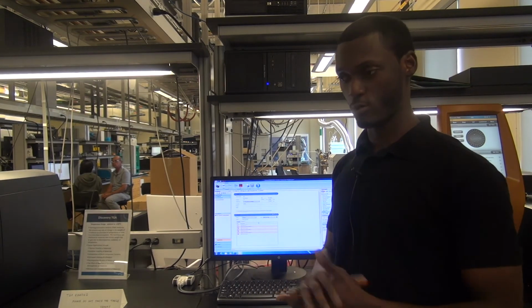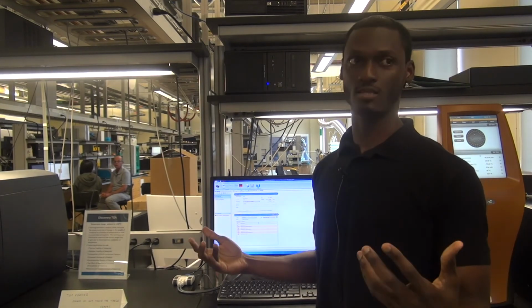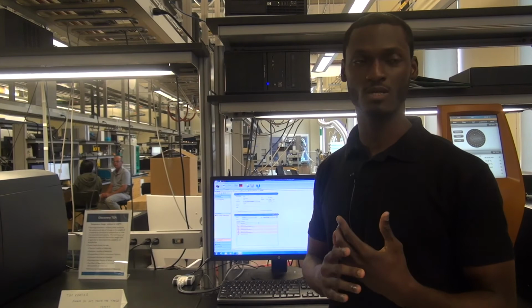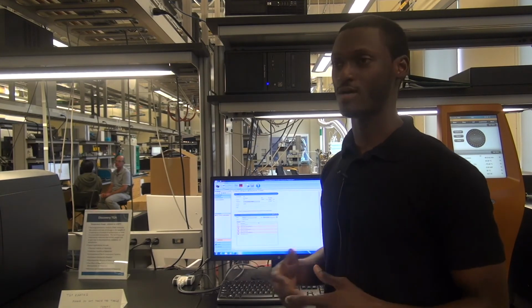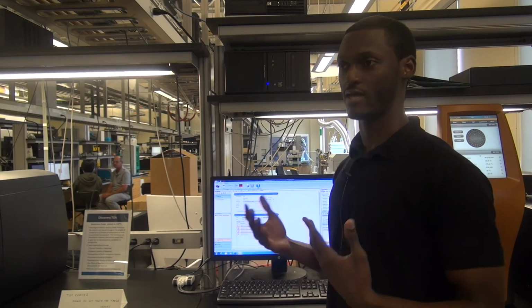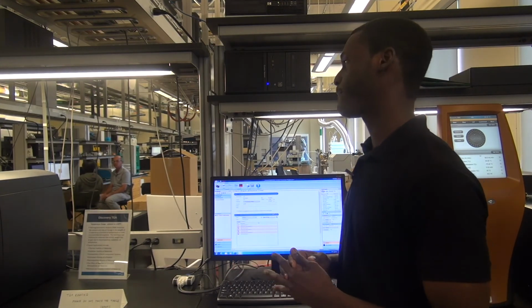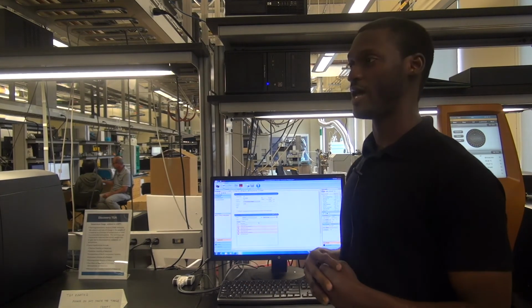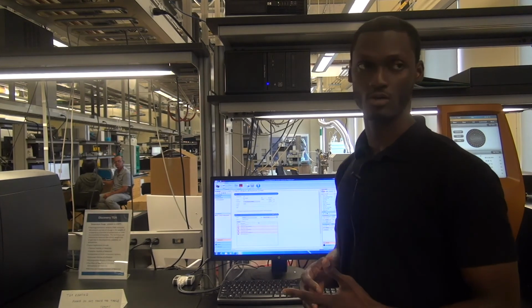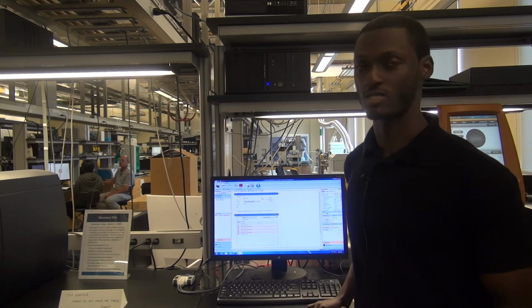In the perfect world, the second and third heats should basically overlay each other exactly, right? Especially if you're using the same cooling rates for both of them, then it should look exactly the same, as long as your sample is stable, and you should be able to repeat that experiment. If you can't, then of course you would have to think about what actually happened and do your analysis accordingly. Okay, so that's basically why multiple heats are necessary.